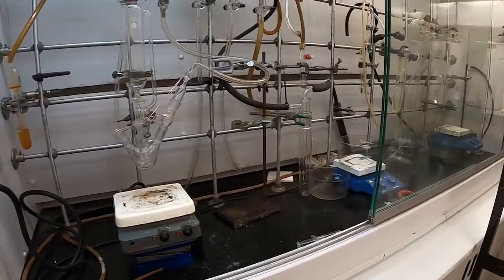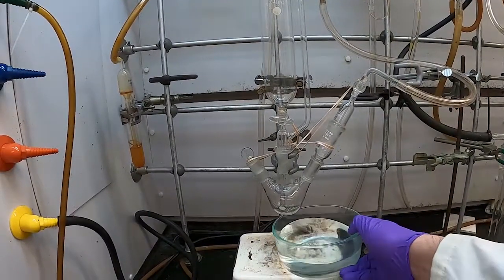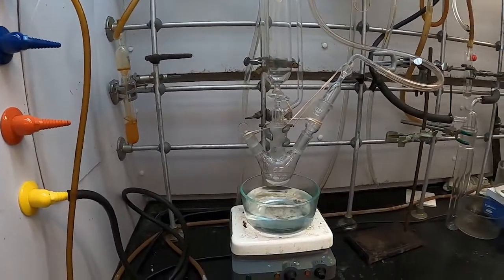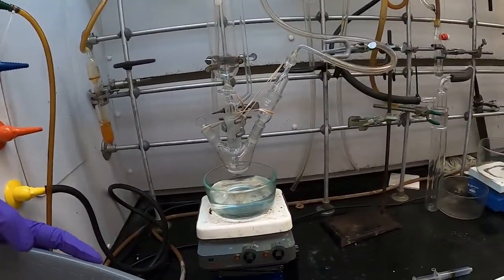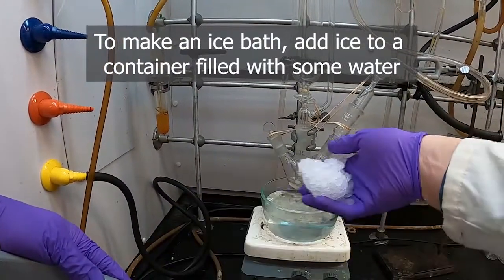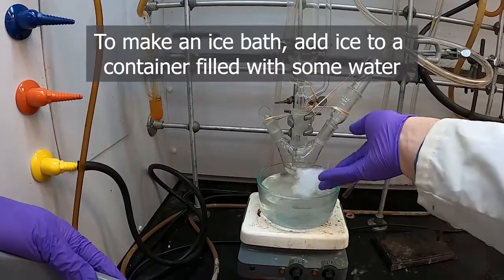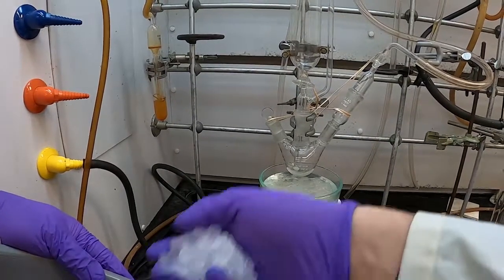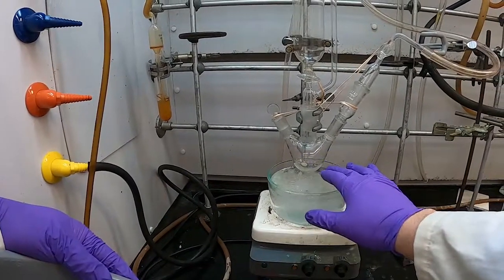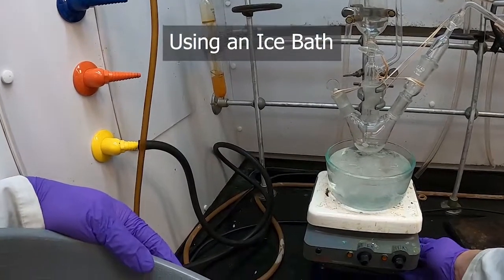One of the most basic ways that we can cool a reaction is using an ice bath. Now, this is just water right now, but I've got some ice here in the bucket, so I'm just going to add some ice here. It's important to make sure that you have enough ice and water that it will be above the level of your solvent, and also that you don't have so much that you'll overflow your bath capacity.